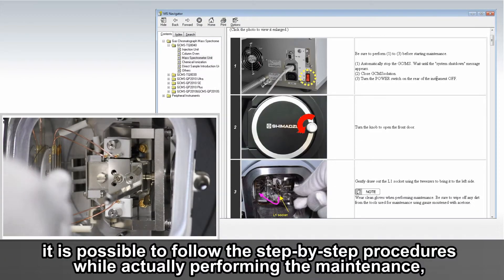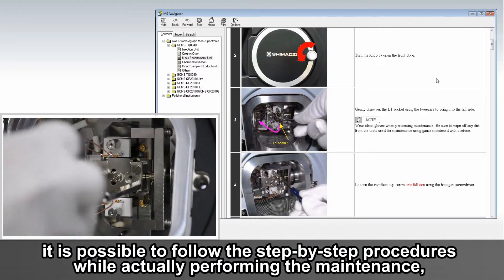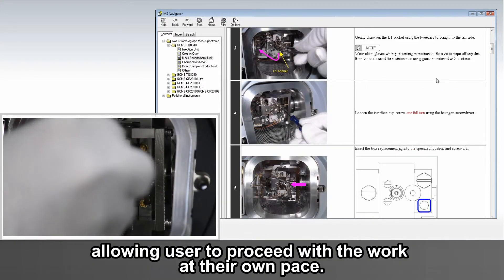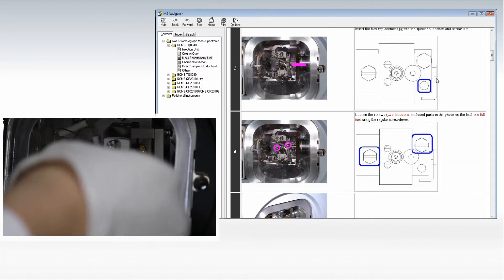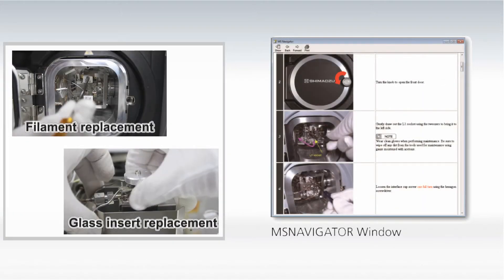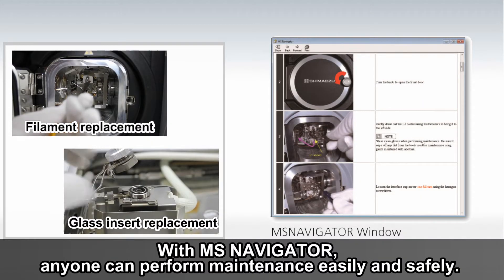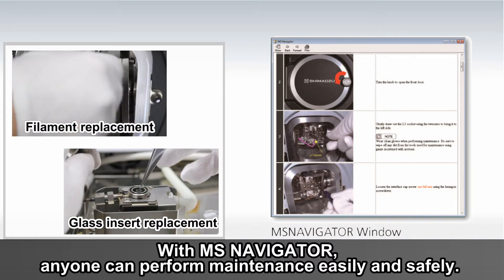With MS Navigator, it is possible to follow the step-by-step procedures while actually performing the maintenance, allowing users to proceed with the work at their own pace. Anyone can perform maintenance easily and safely with MS Navigator.